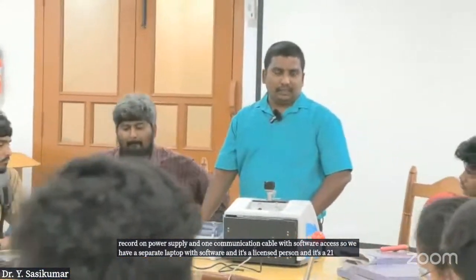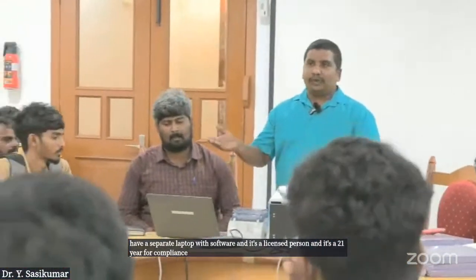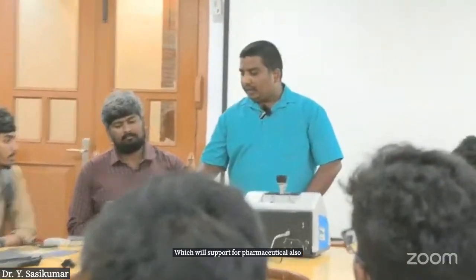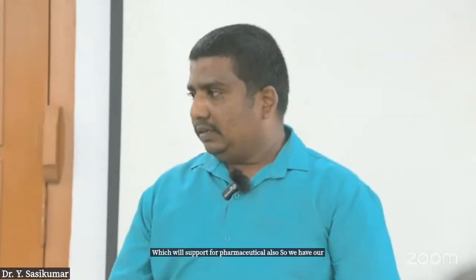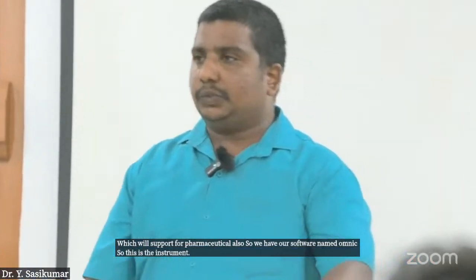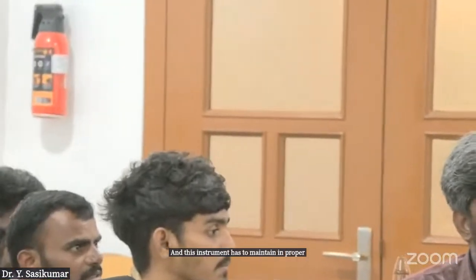We have a separate laptop with software. It's a licensed version, and it's 21 CFR compliant, which will support pharmaceutical use also. Our software name is Omnic. This instrument has to be maintained at proper humidity and temperature.